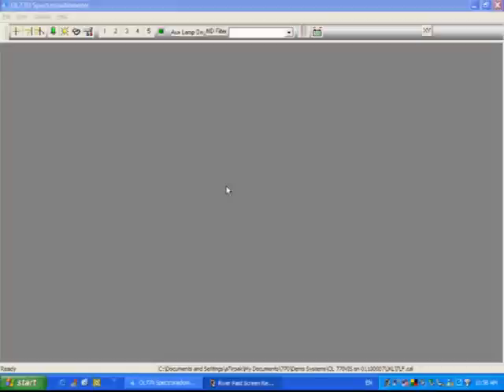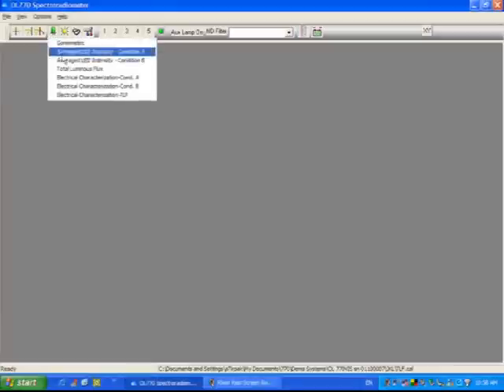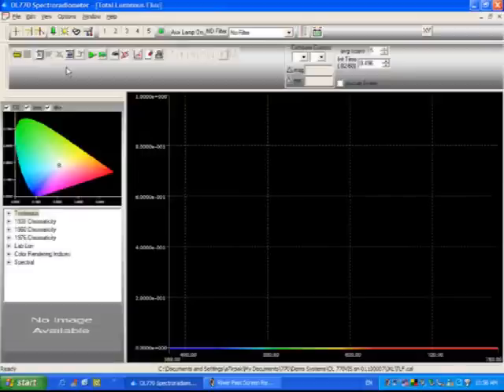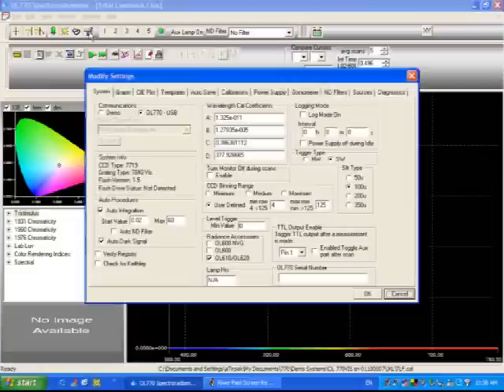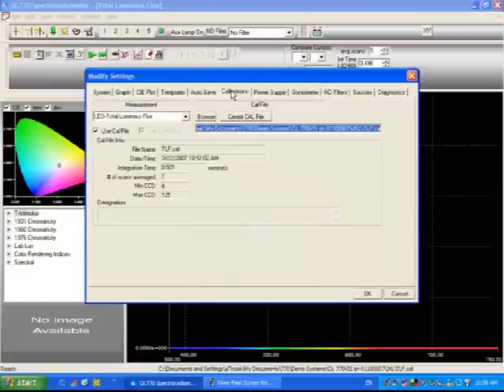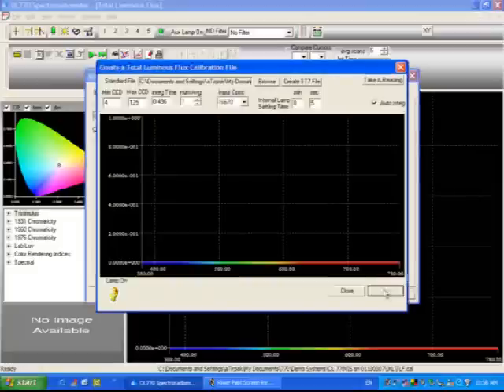Now we're going to move into the software portion of our demonstration, and we're going to look at total luminous flux, which is contained under the LED module here. Click on the LED and total luminous flux. First thing we want to do is create a calibration file, so we go into modify settings, calibrations, and create cal file.